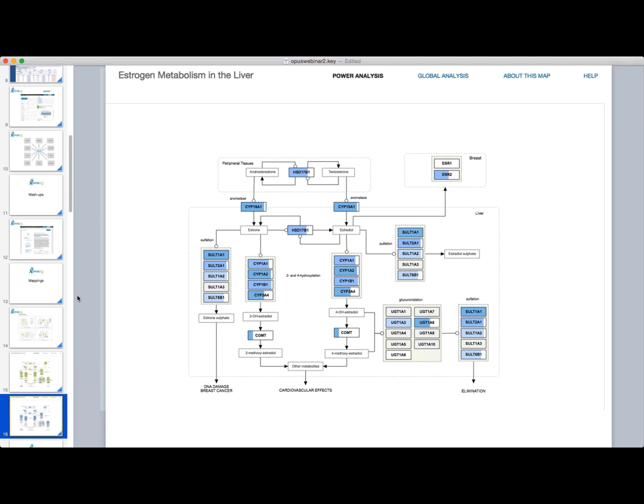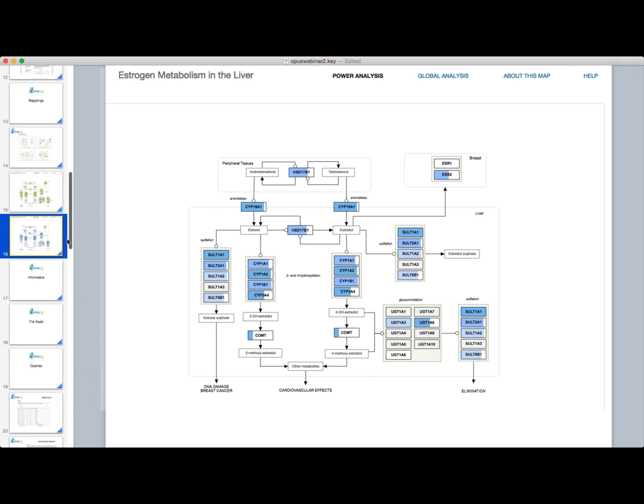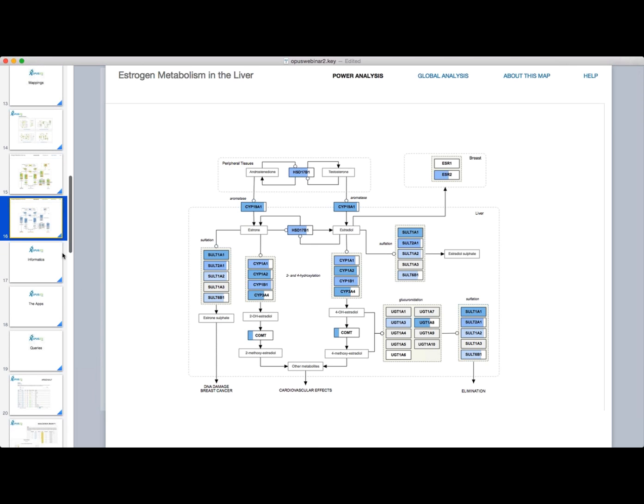You know how when you start losing power, the battery starts getting smaller and smaller? Well, this essentially tells us what degree of functionality can be expected from that gene given the outcome of those SNPs. So it's kind of like the battery report on this. And you'll see later on, these things are clickable and they bring up a wealth of information.